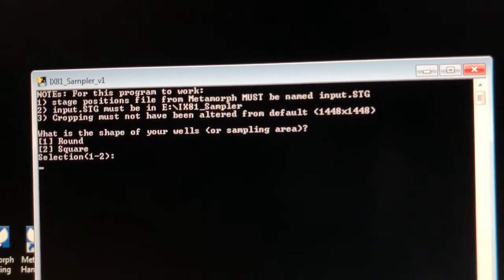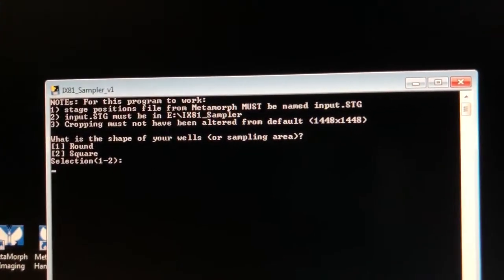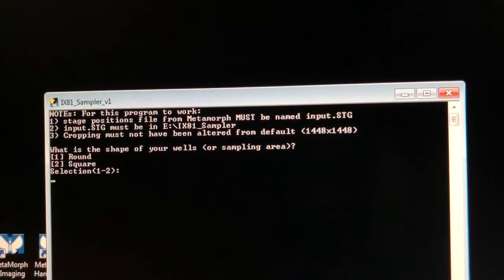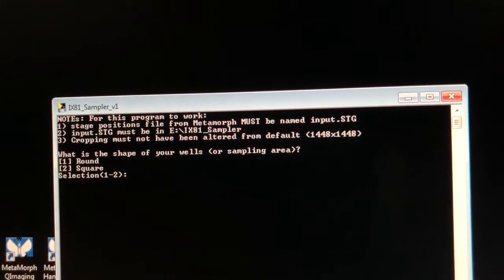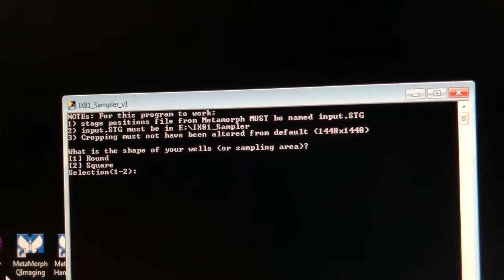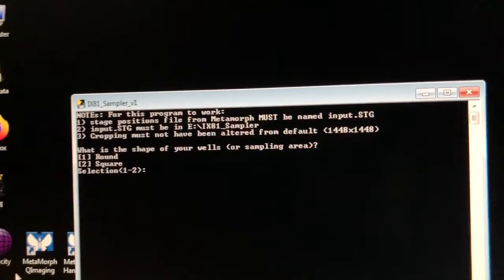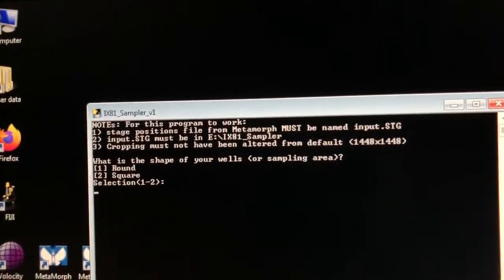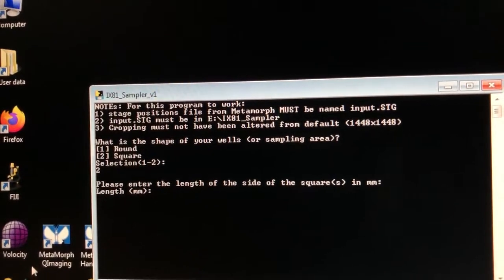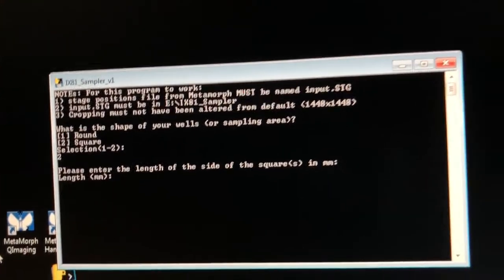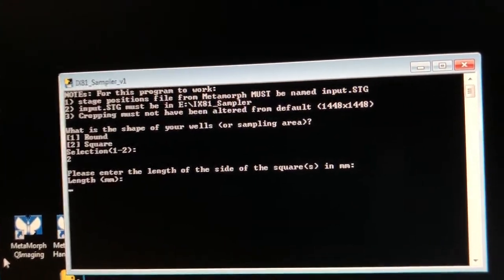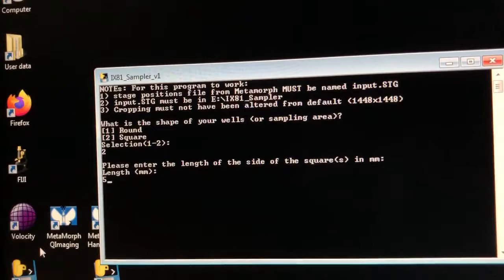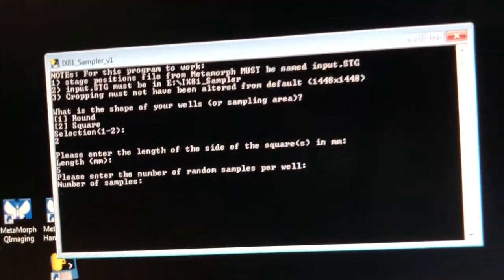So the first is what is the shape of your wells or sampling area? And so here you can choose whether to explore a square or a round area. And the idea is the round is there in case you have a well and you want to sample the well. So you wouldn't want to sample corners where the well isn't there. So I'm going to say just square which is option two. Please enter the length of the side of the square in millimeters. So this is the side of the area you want to sample. So I'm going to say okay let's just do a five millimeter area from where I'm centered.